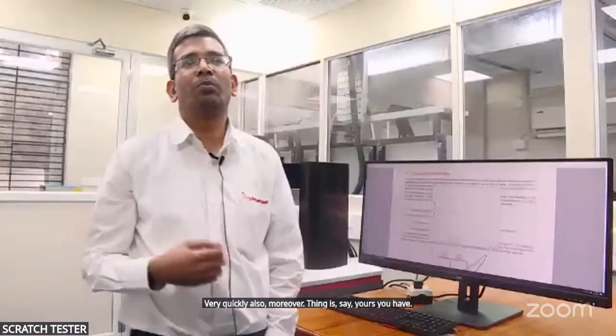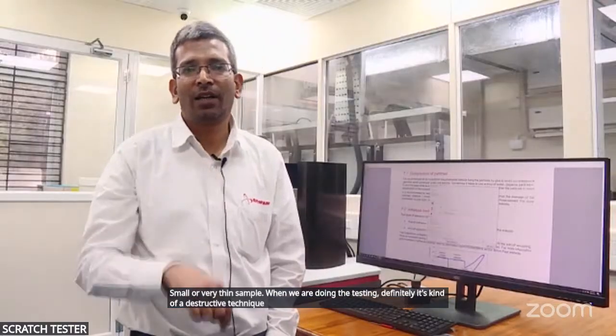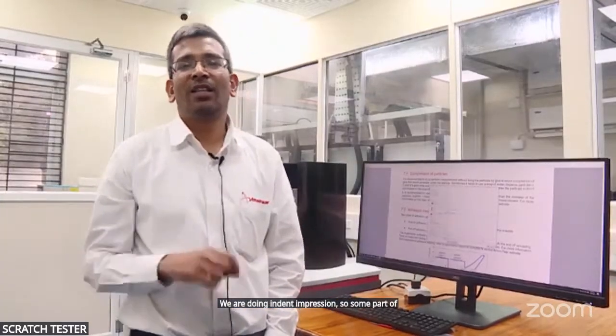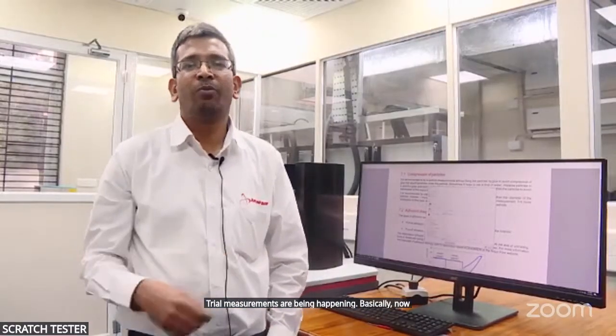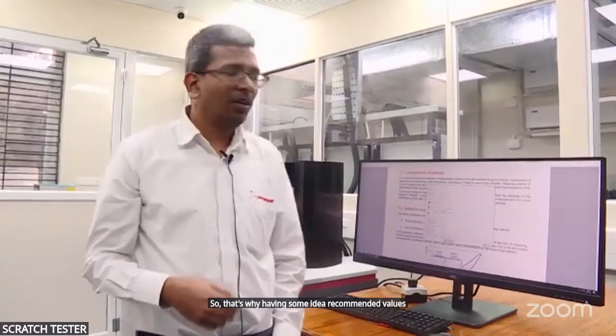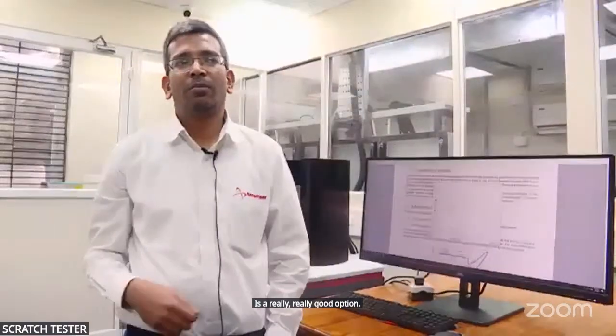Moreover, say you have a small or very thin sample. When we are doing the testing, it's definitely a kind of destructive technique, because we are doing scratches, we are doing indent impressions. So wherever those trial measurements happen, that area is now out of the picture for doing the next measurement. That's why having some recommended values to start with is a really good option to start your measurement.